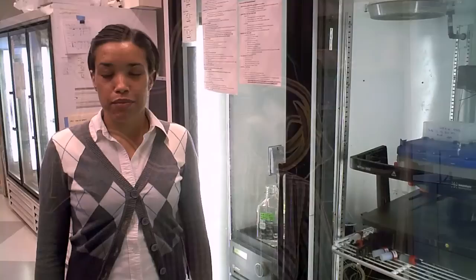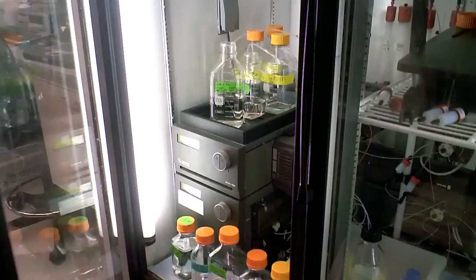Hi, my name is Stephan Bernard and I'll be giving you a tour today of the Janet Smith Lab. Because crystallography is dependent on having pure protein samples, we use FPLC to purify our protein. And here is the pump that we use.